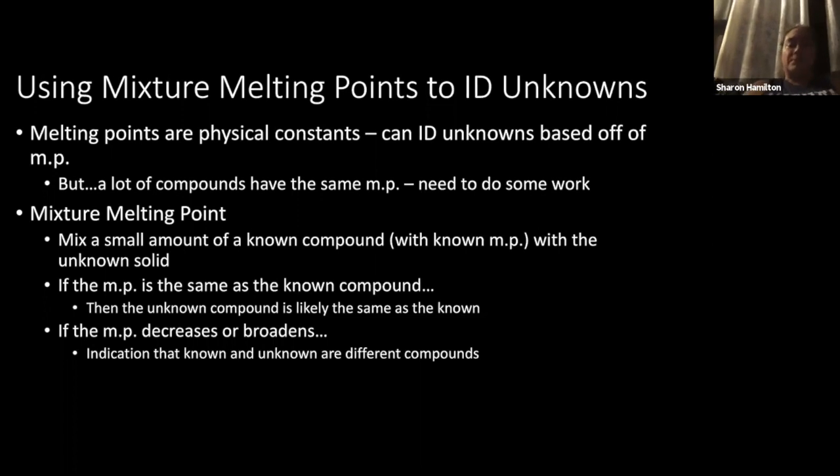So I mentioned earlier that you'll be using the mixture melting point technique to identify unknowns.